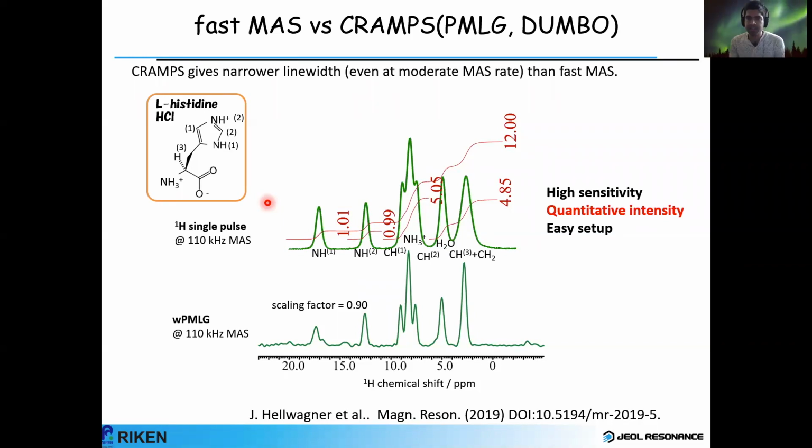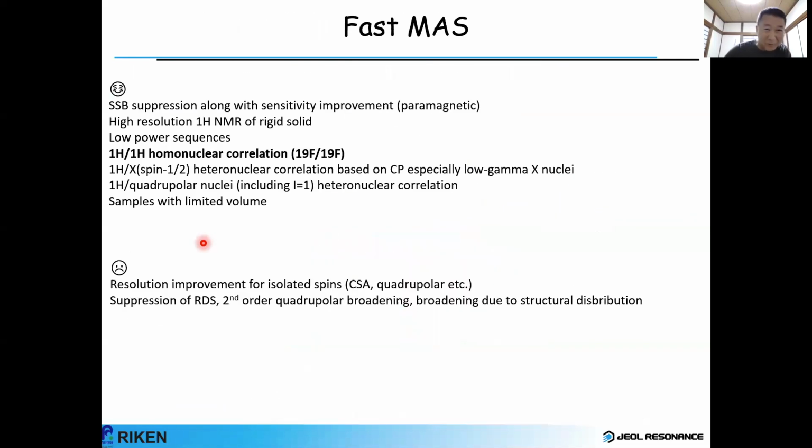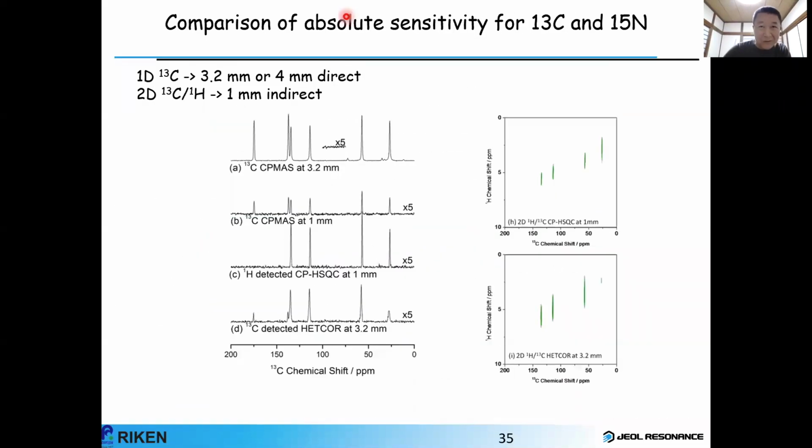So the next question is from an anonymous attendee. Mathematically, how does the loss of signal due to lower sample volume compete with the improvement due to the smaller coil? Yes. That quite depends on the system, and this is also involved in my talk.